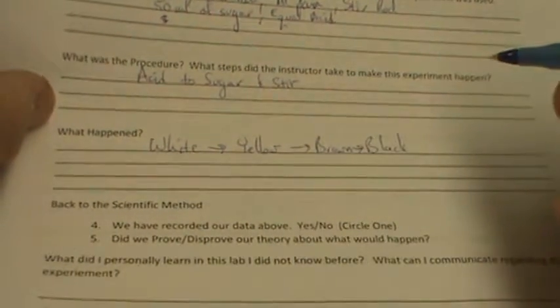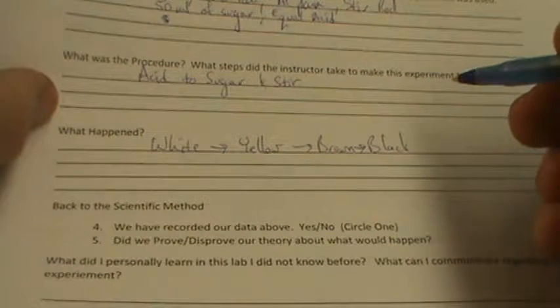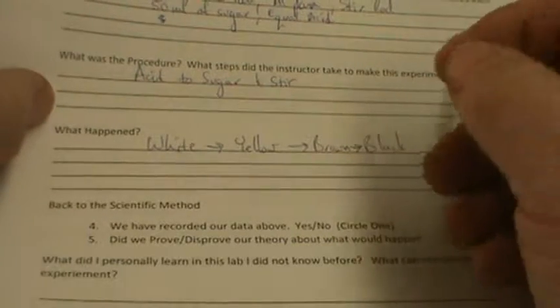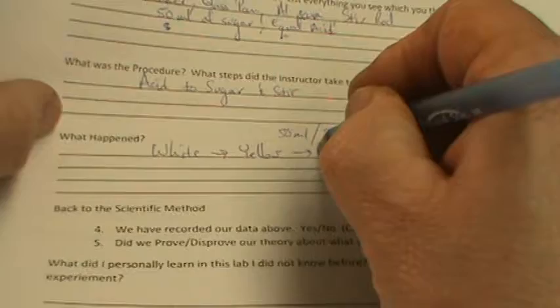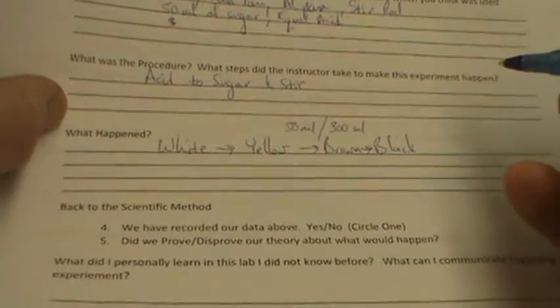This will take about a minute, okay? It doesn't happen right away. I had a teaching colleague tell me they tried this and it didn't work. I don't know if they didn't wait long enough, used too much acid or not enough acid, I don't know. But I used equal amounts, about 50 milliliters in a 300 milliliter beaker.